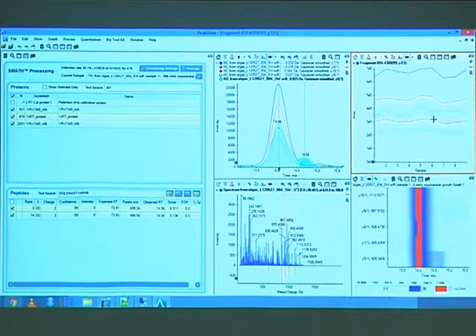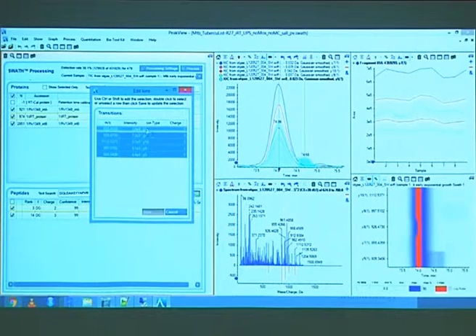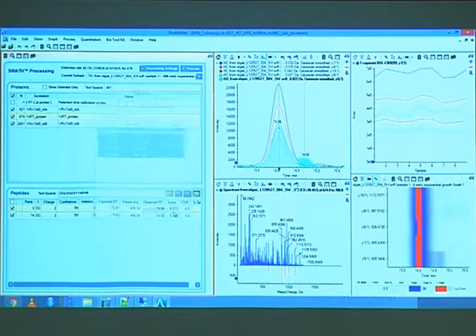Below are the expected intensities, which is the same thing as essentially your assay, the relative intensities there. You can get them if you click here on that button, which is ions. A window pops up and shows you these are the ions and the intensities and m/z values. If you have more than 5, say 20, you can add and remove some to see how they perform. But usually I don't do that because it's very tedious if you want to do it for a significant number of proteins.